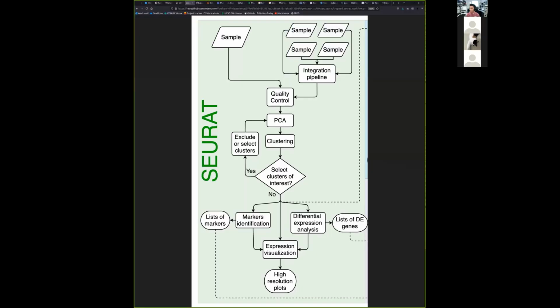So let's continue on and proceed with the next part of the pipeline. I'm going to show you again the Seurat pipeline so that we know where we are right now. Might seem a little bit like we are behind time, but don't worry because we just finished quality control, but the next few parts are actually pretty fast. Because we spent a lot of time understanding the object, how to create new columns and look at the quality control, now this is going to be a little bit faster.